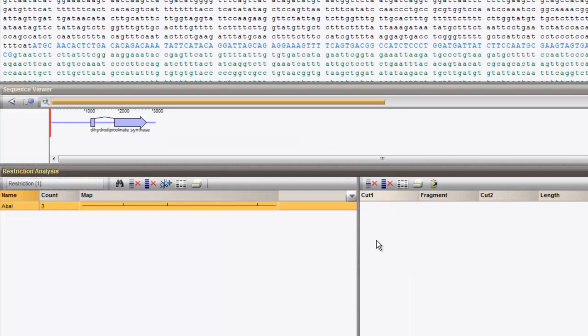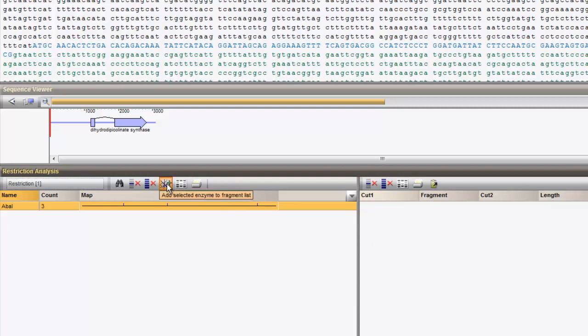To map the restriction enzyme onto the sequence, double-click on the enzyme in the left panel or press the Scissors button.